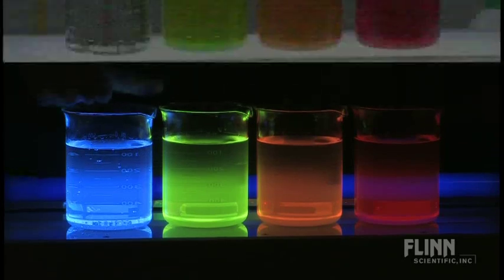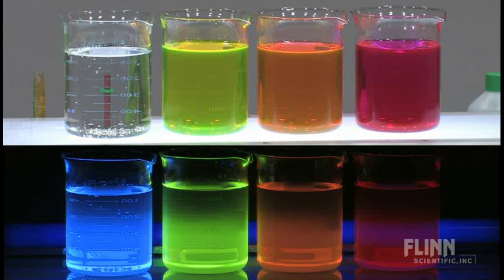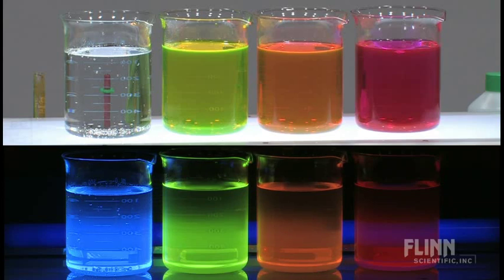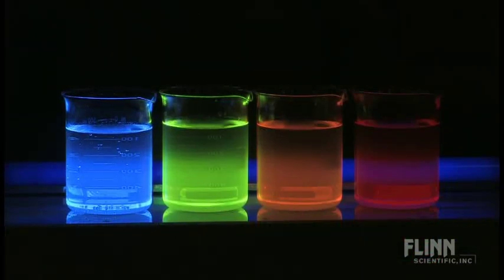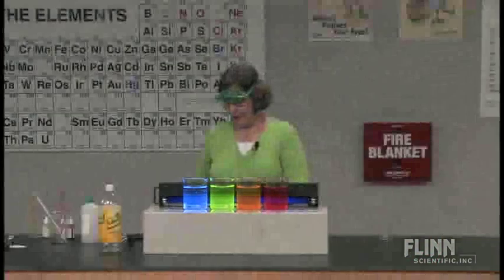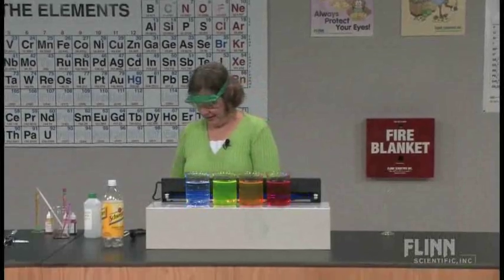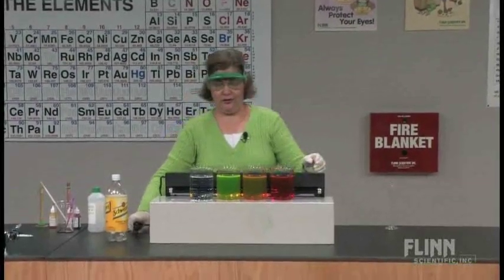The quinine was colorless; it's now fluorescing blue under a black light. The fluorescein was yellow; it's fluorescing bright green. The eosin was orange and is fluorescing more of a yellow color, and the rhodamine was pink and is now fluorescing an orange color. Let's take the lights back up. Let's turn off the black light and go back to our original colors.